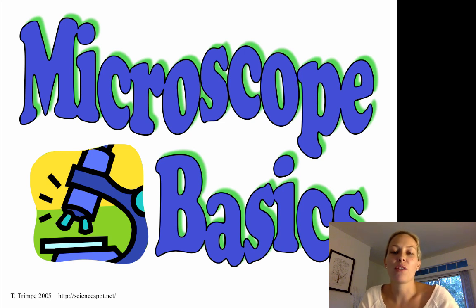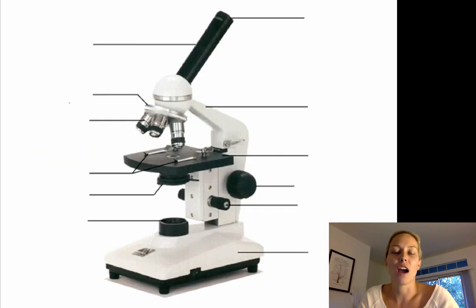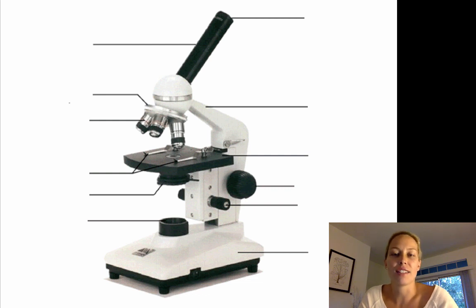Today we're going to be going over the basics of the microscope. We're going to be using a compound light microscope and I'm going to be going through each of the different parts and their functions. Be sure to write this down on your note sheet.